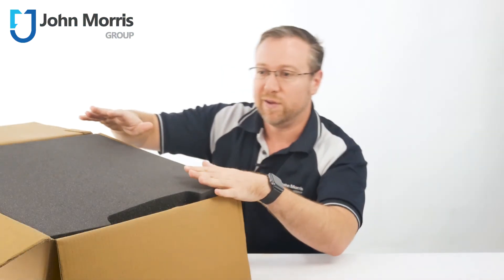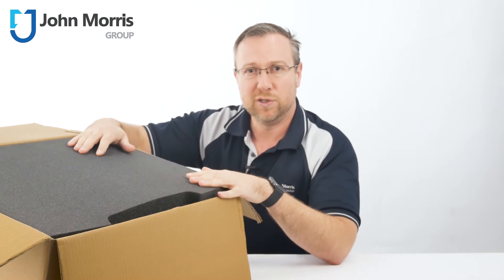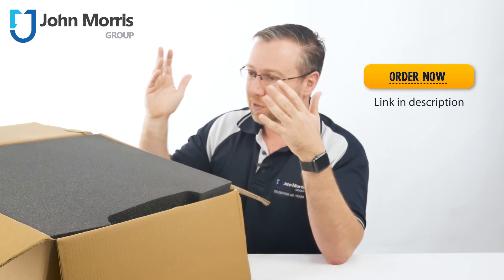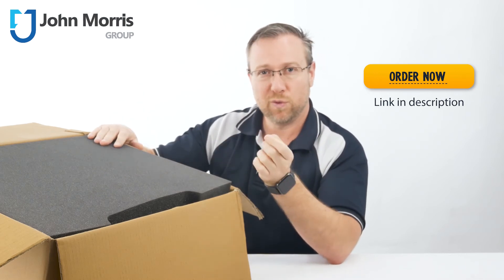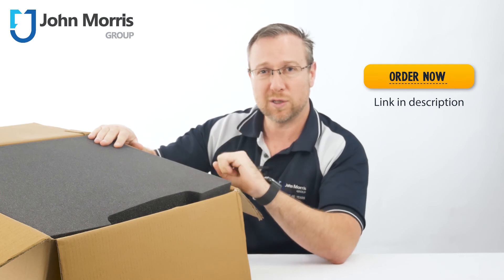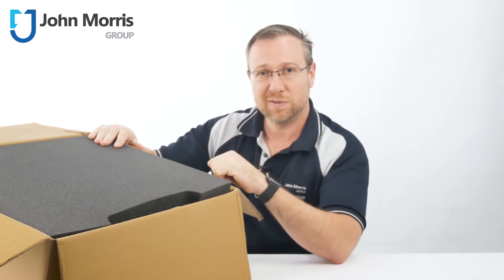So, there you have it. We thought it's really important for you to see just how well Lamy packaged their viscometers and rheometers. If they put this much attention and detail to the small things like packaging, imagine the quality of the actual products themselves. Thanks so much for watching, and bye for now.